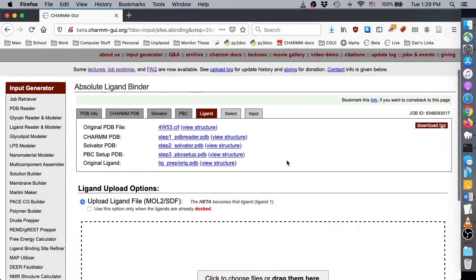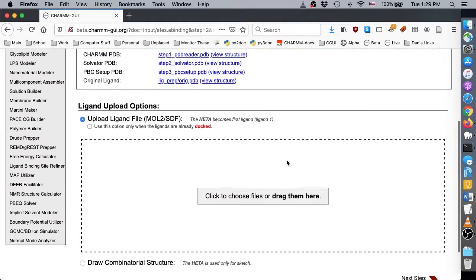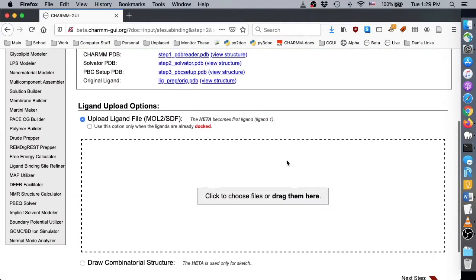On the next page, we are shown options for uploading or drawing ligand structures, which you should remember from the previous videos. If you have your ligands available in SDF or MOL2 files, you can upload them here, and you should indicate whether the uploaded structures are already in their docked position.